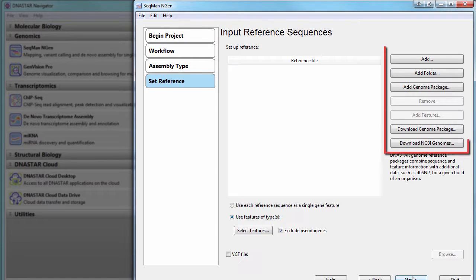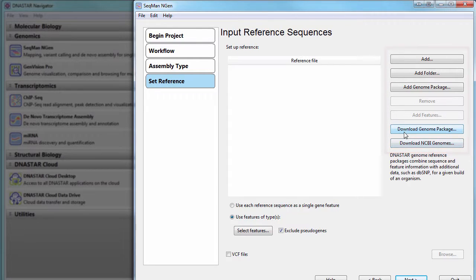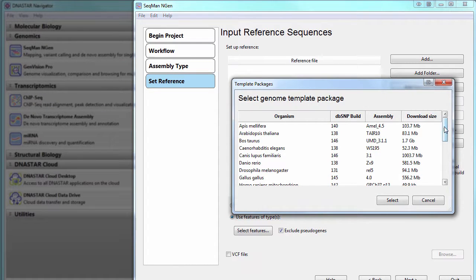Now load your reference sequence or genome template package. In this case, I'm going to use a human genome template package that I've downloaded from the DNASTAR website.